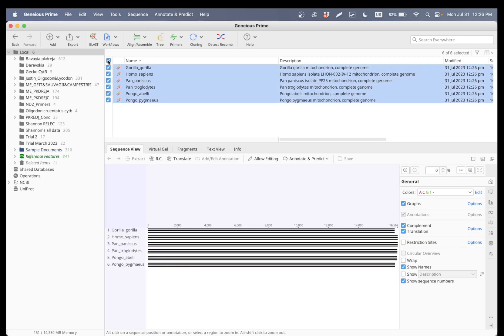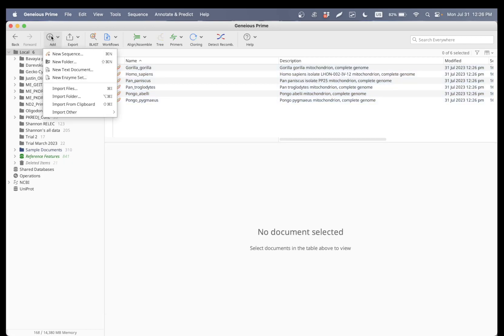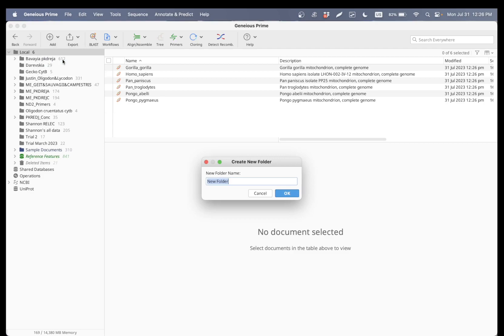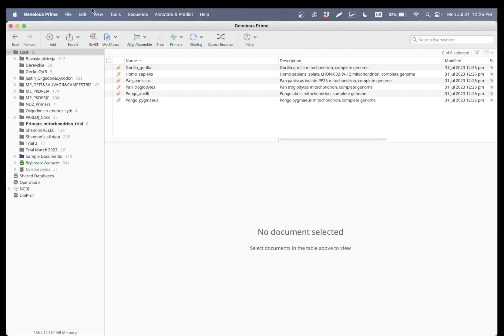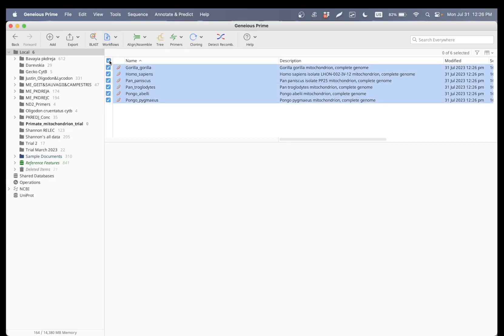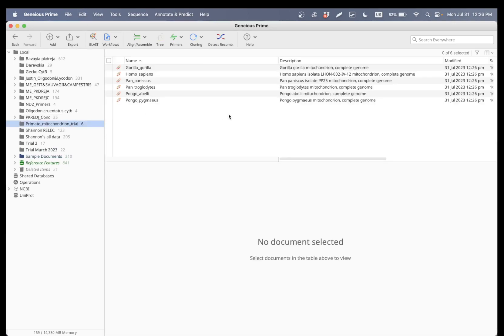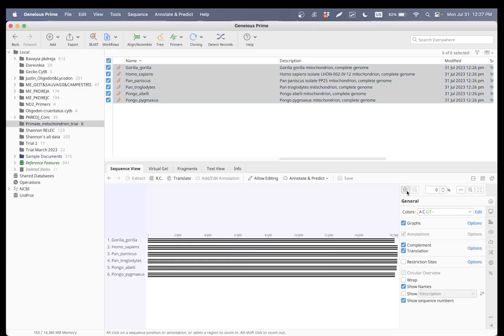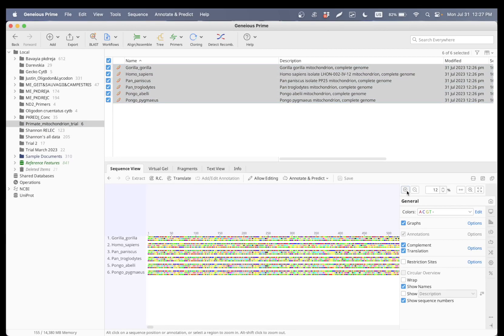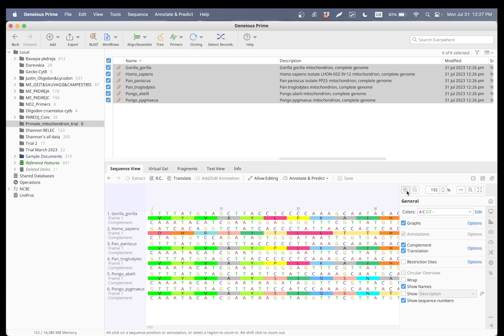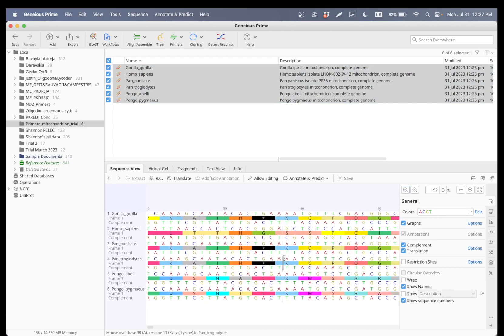All right, once that's done, let's create a new folder to keep everything organized. I'm going to call this 'primate mitochondrion trial.' Let's drag all of these by selecting and dragging them down, put them into this folder. So now everything looks better.